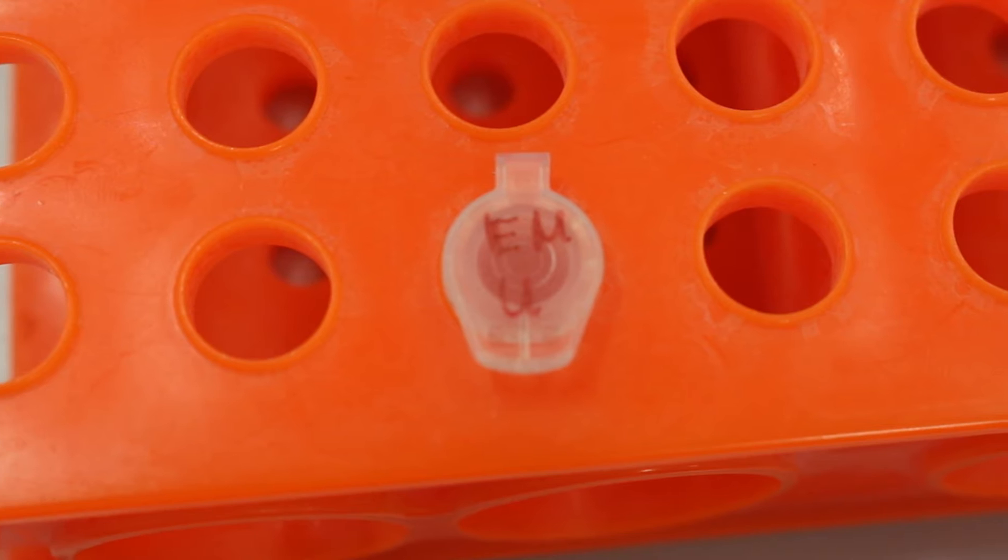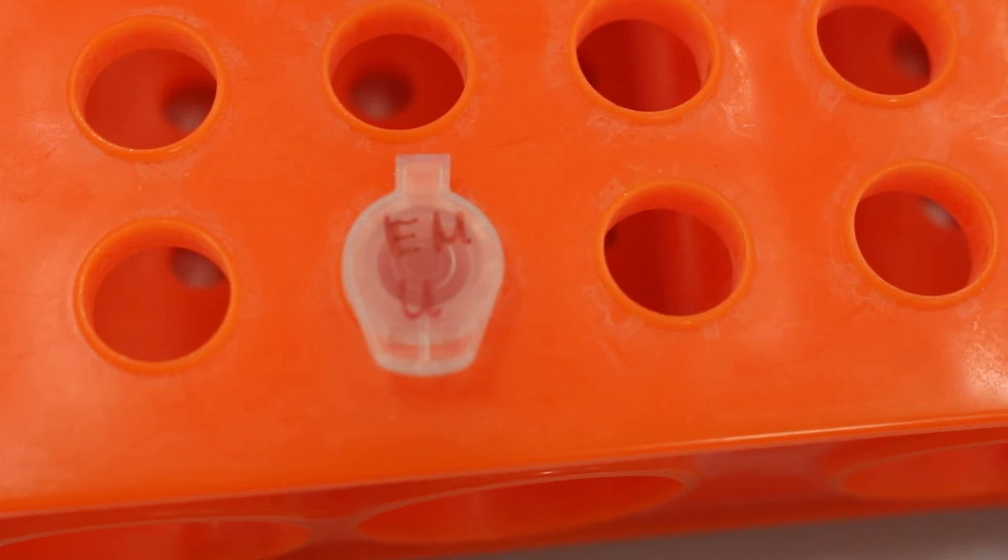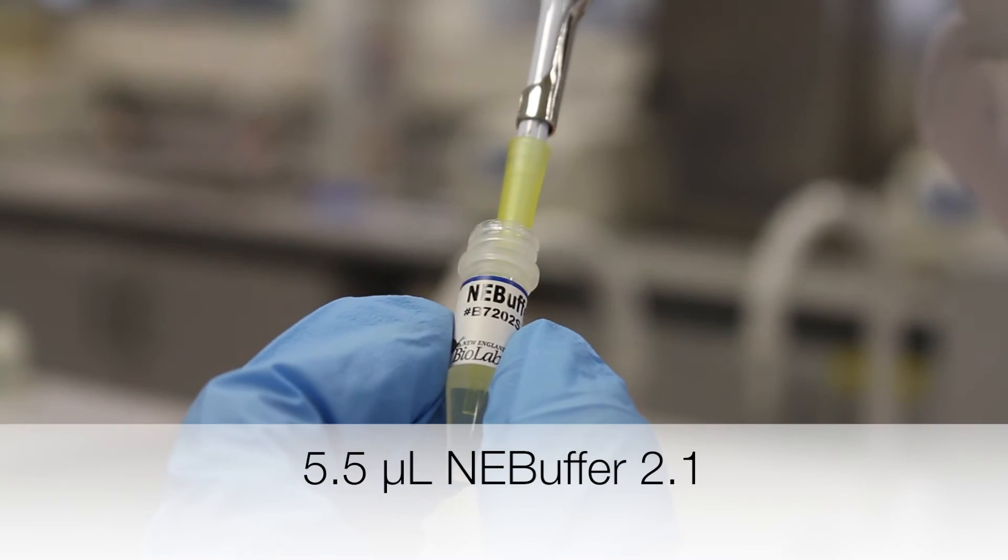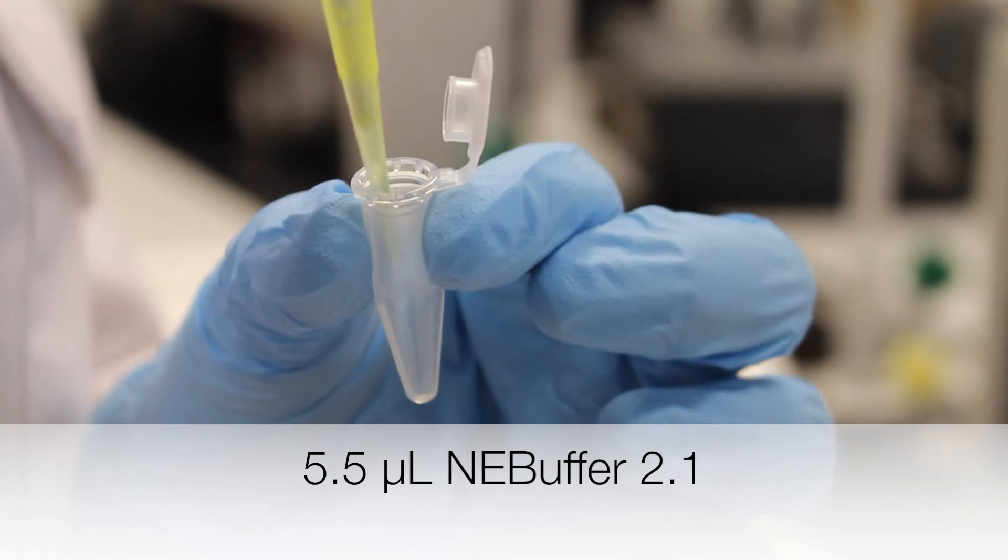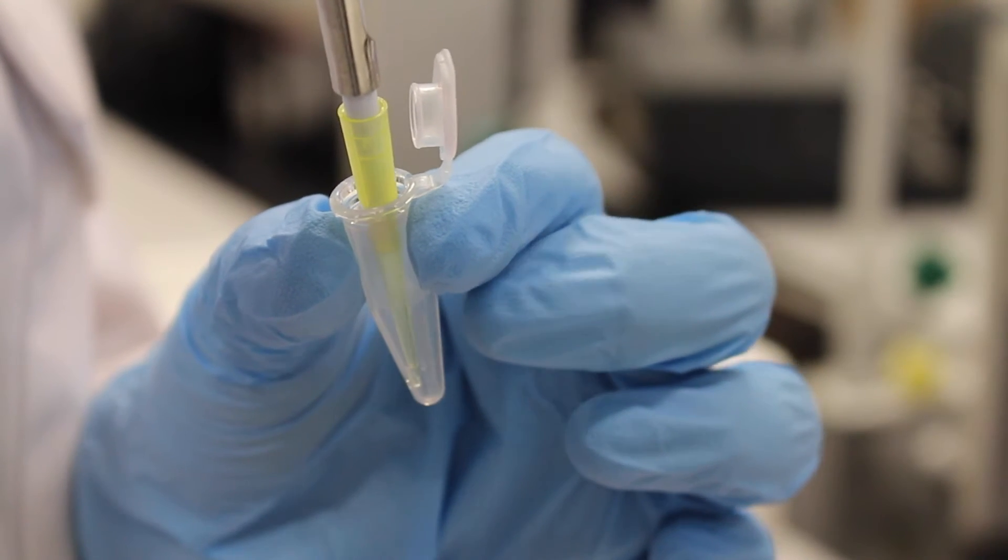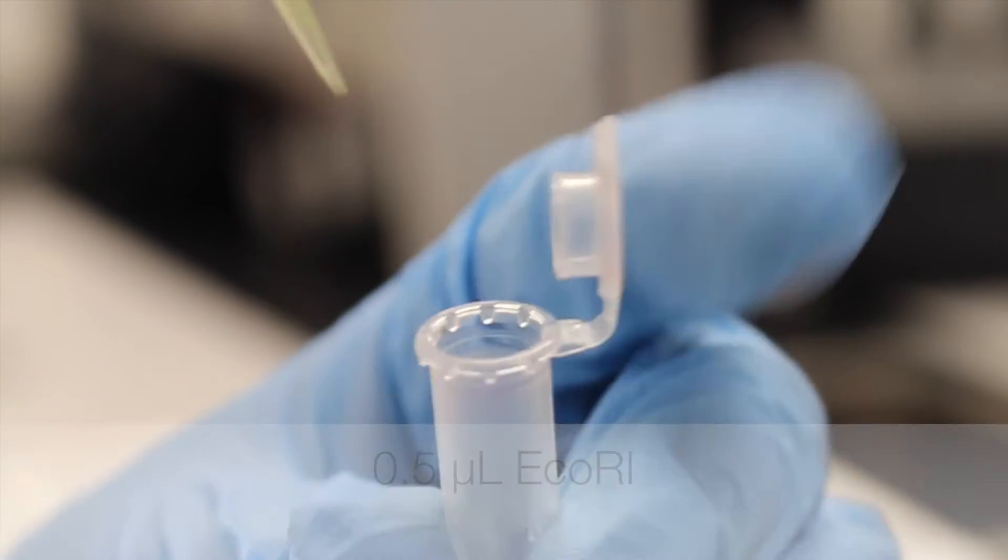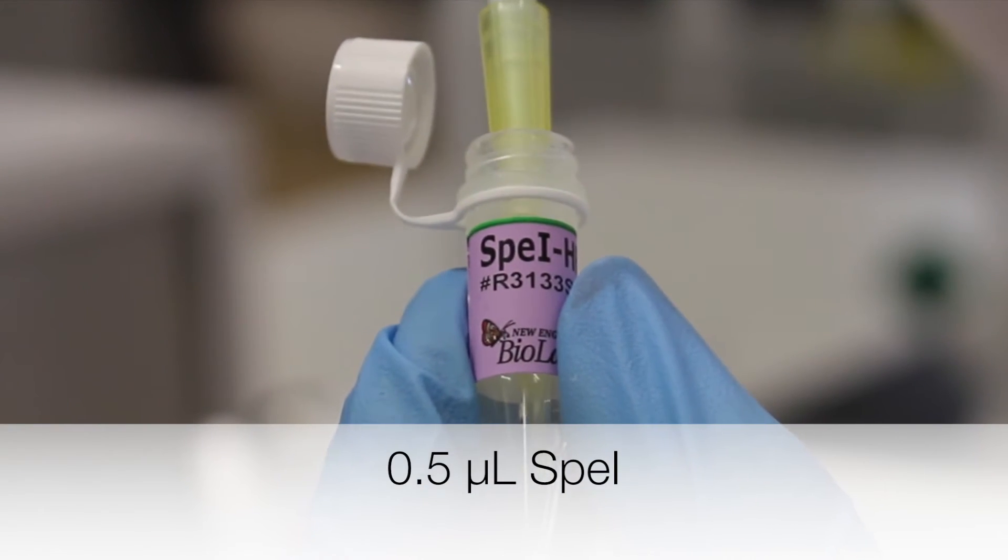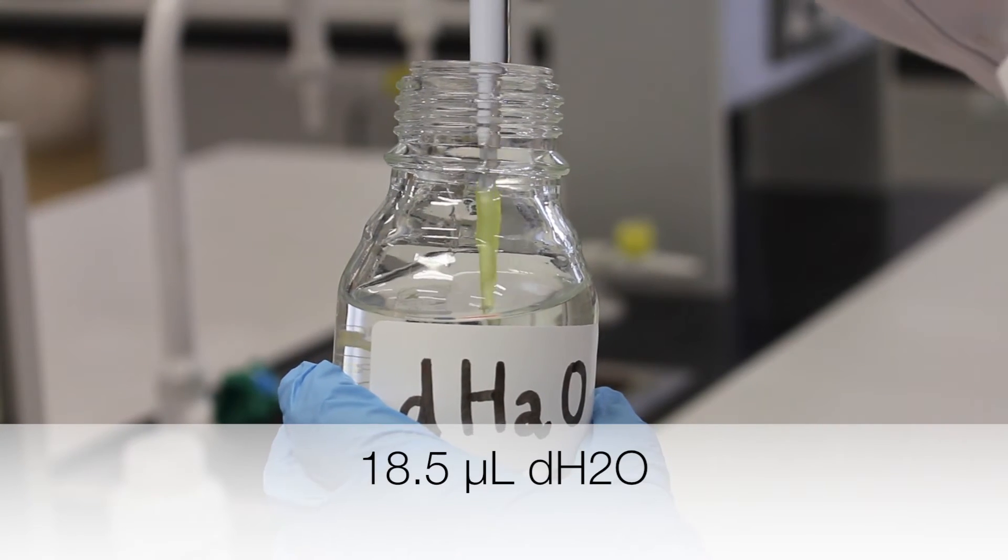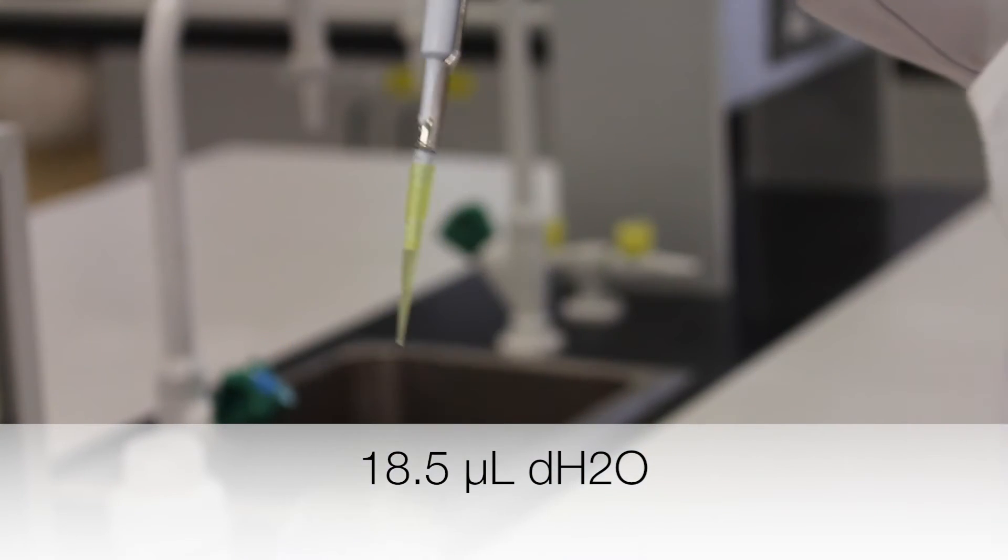The enzyme master mix for the upstream part will contain the following: 5.5 microliters of NEB buffer 2.1, 0.5 microliters of EcoR1, 0.5 microliters of SpeI, and 18.5 microliters of distilled water.